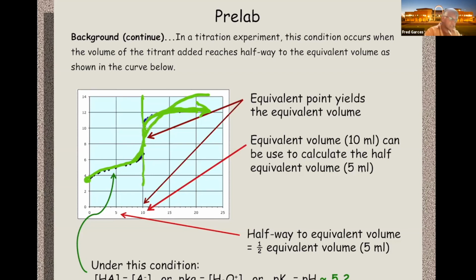You need to see this tail so that you can define the inflection point. You can see where the slope of the curve goes from positive to negative, or you can take a first and second derivative.